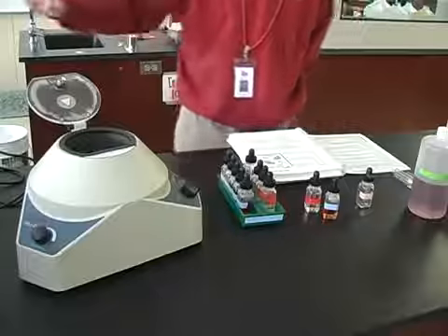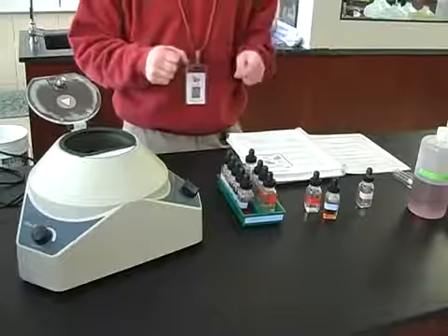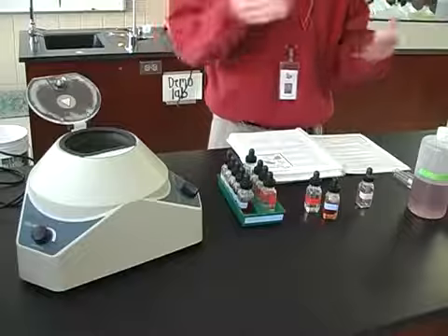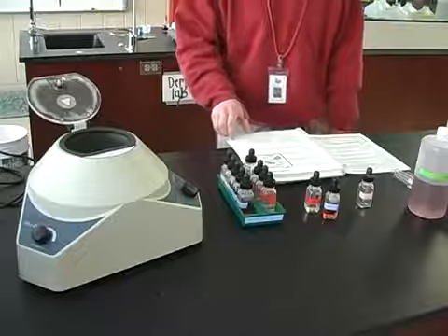There'll be lots of bottles of distilled water around here, and people really like to have their squirt bottle filled all the time. And some people get really particular about where their stuff is. So if you're in an hour, you realize that people the next hour will be using the same equipment, so put it back where you found it.